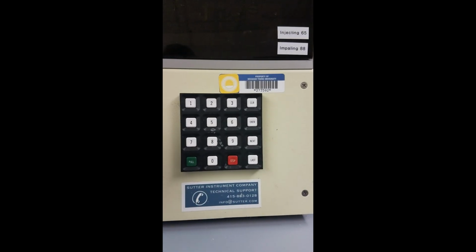Close the lid. And then pull right here. It'll start to hum a little bit. Soon you'll see a glow as the filament heats up. And then that loud noise lets you know that it's done.